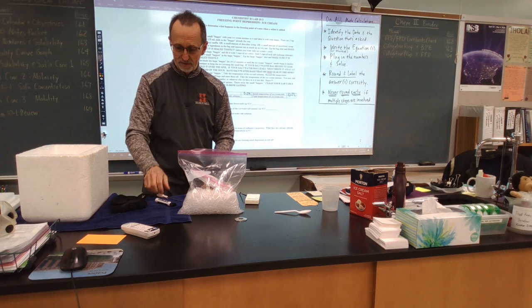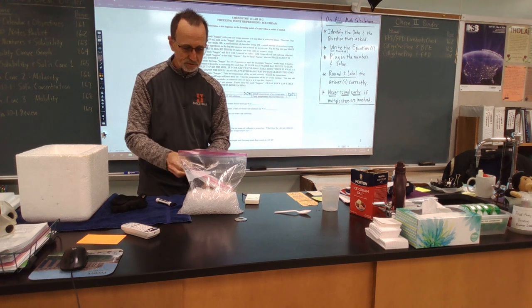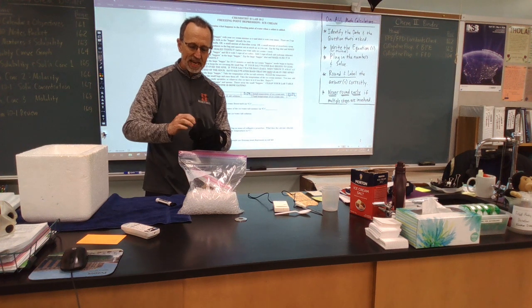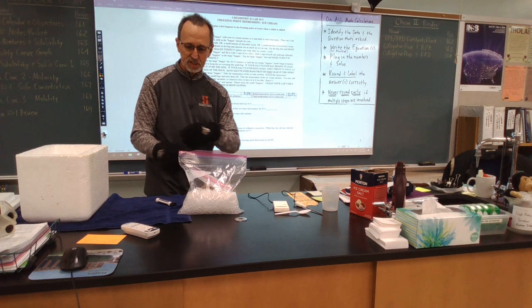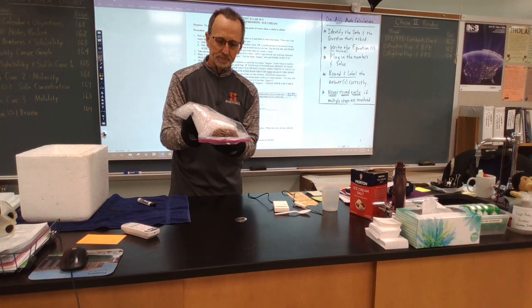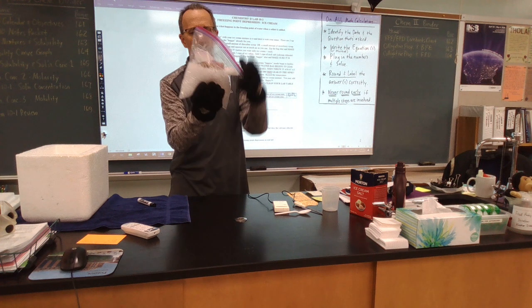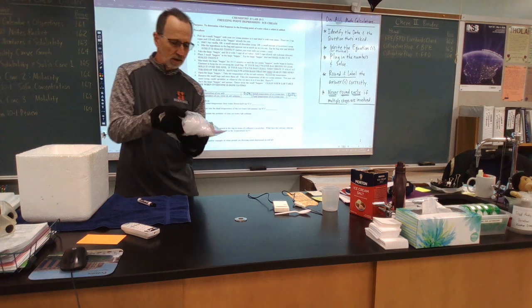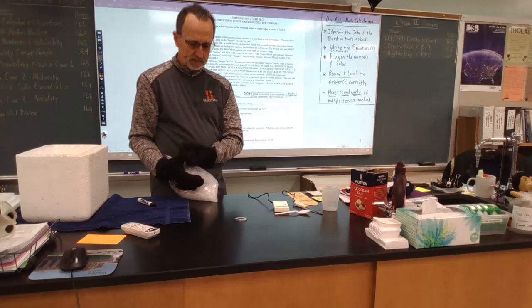Definitely going to put on the old gloves. I do not want to be holding this bag without protection over my hands, because I'm telling you, this thing gets extremely cold, extremely fast. So now I am just going to work this around for several minutes.